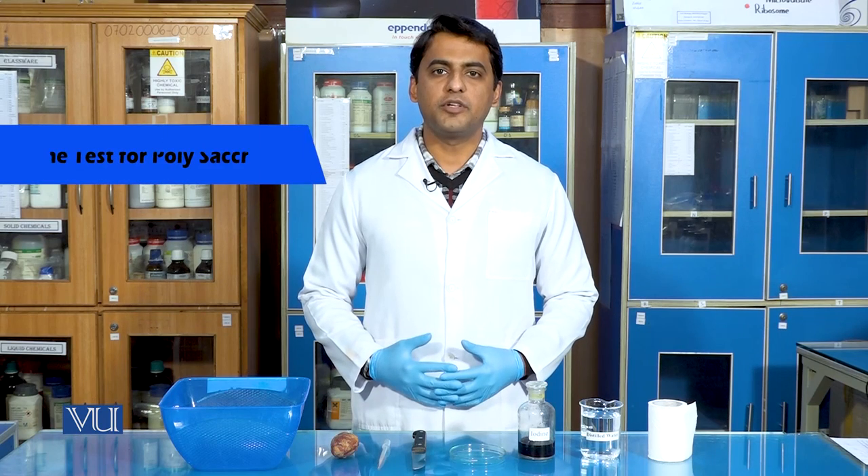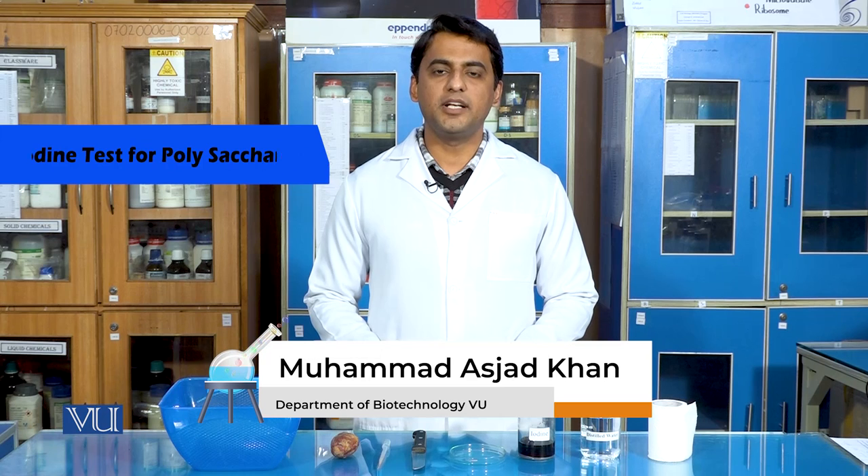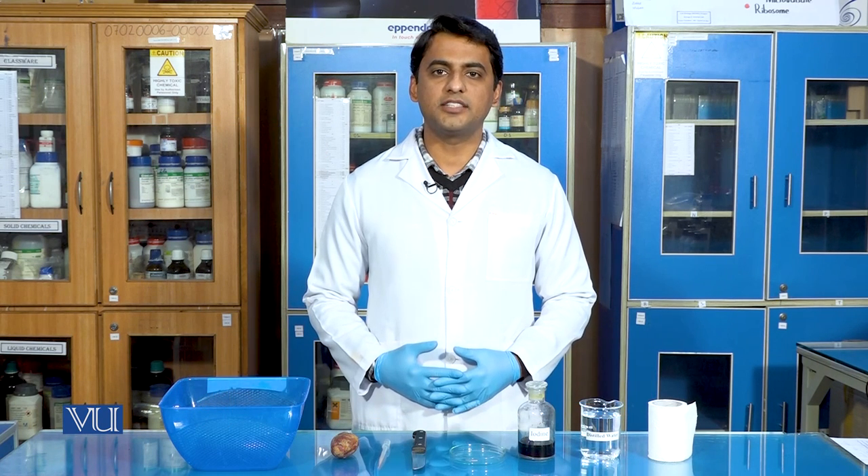Dear student, today we are going to perform the iodine test for polysaccharides. Iodine test is mainly performed for the detection of carbohydrates, among which sugar and starch are the main sources of carbohydrate present in our food. So let's start with the experiment.